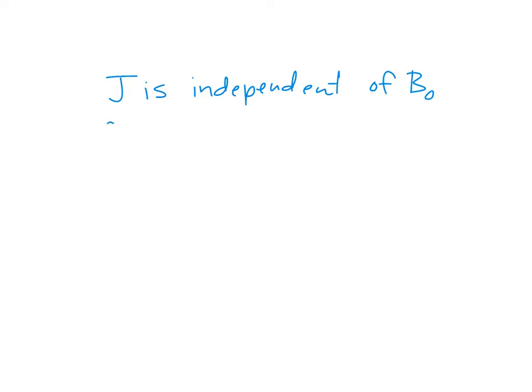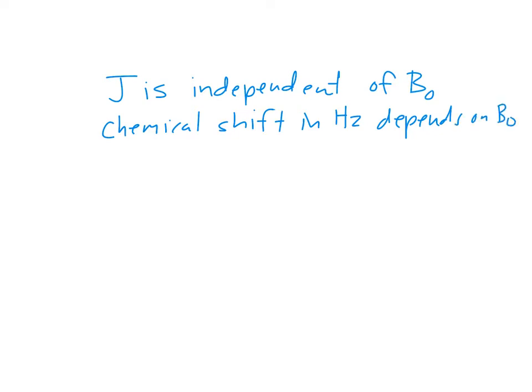So chemical shift in Hertz depends on B0.